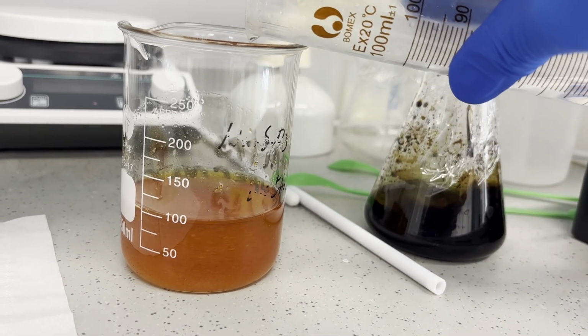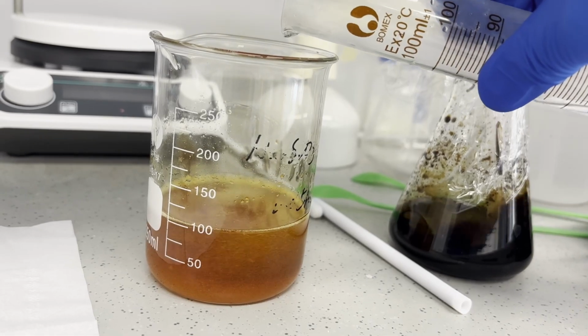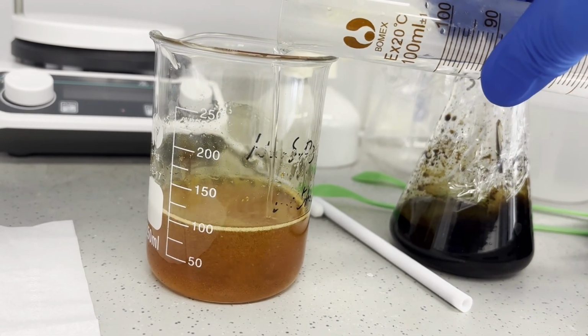But all in all, there is a positive correlation between the ligand's pKb values and their maximum absorption wavelength of the complexes, proving that my experiment is successful.